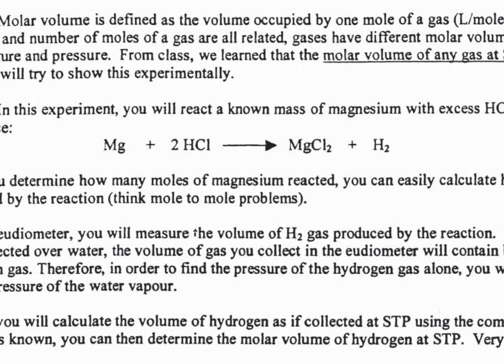You see the bubbles forming, and we collect hydrogen gas. That's the gas that we're going to use to determine the molar volume of a gas. Remember, all gases act the same, at least ideally, anyway. Okay, so let's move on.